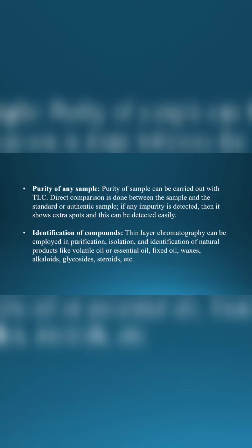Identification of compounds. Thin layer chromatography can be employed in purification, isolation and identification of natural products like volatile oil or essential oil, fixed oil, waxes, alkaloids, glycosides, steroids, etc.